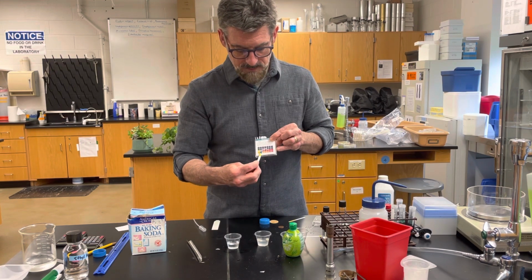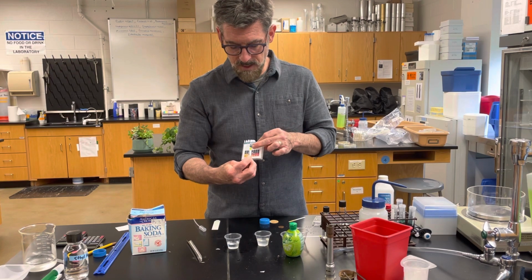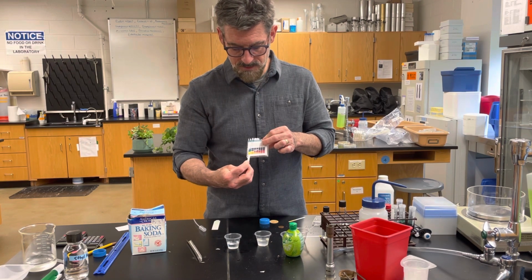We're not quite up here. Now it starts to get around 10, sort of reddish in that third block. And you can see it's still in the greenish range, which means it's down here like 8 or 9.